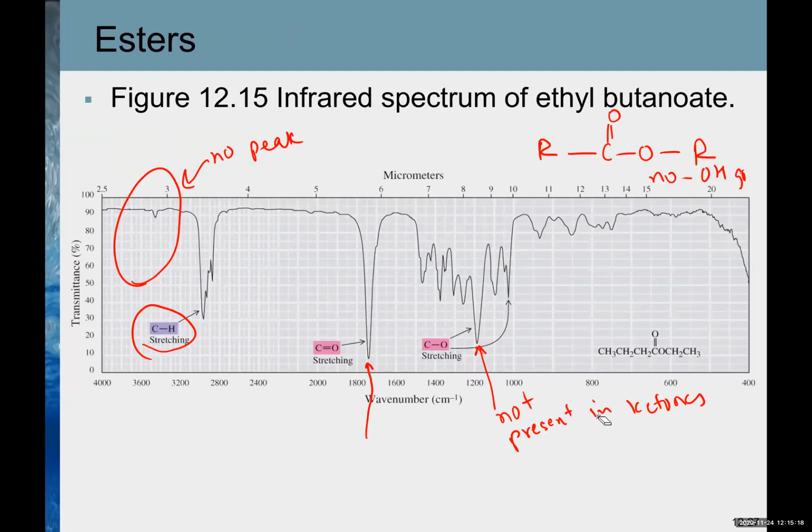So, with certain instances that you've shown, an abundance of a particular bond seems to at times intensify the peaks. Would we see the same behavior in a far more complicated compound, like testosterone or something that has a bunch of different attachments to it? Would that show just crazy amounts of peaks, or would we see some sort of familiarity?